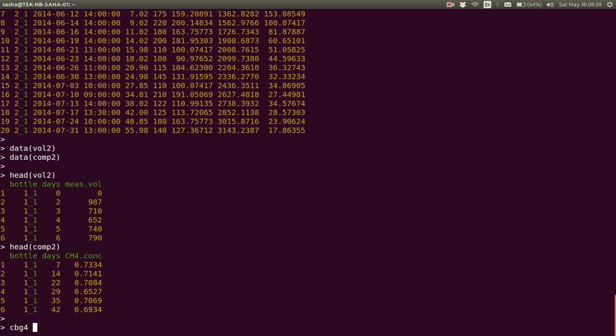Say cumBg4, cumBg. Now we're working with vol2. I'm also going to assume a temperature of 20, but that really should match the temperature at which volume was measured.